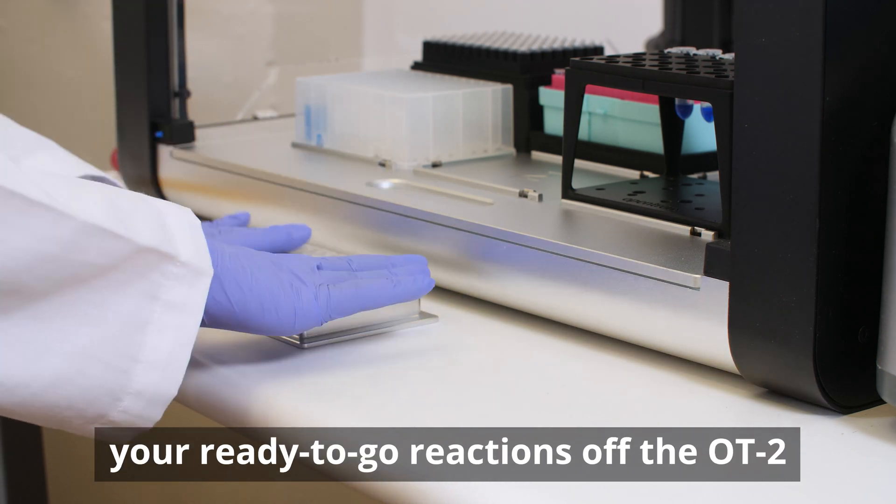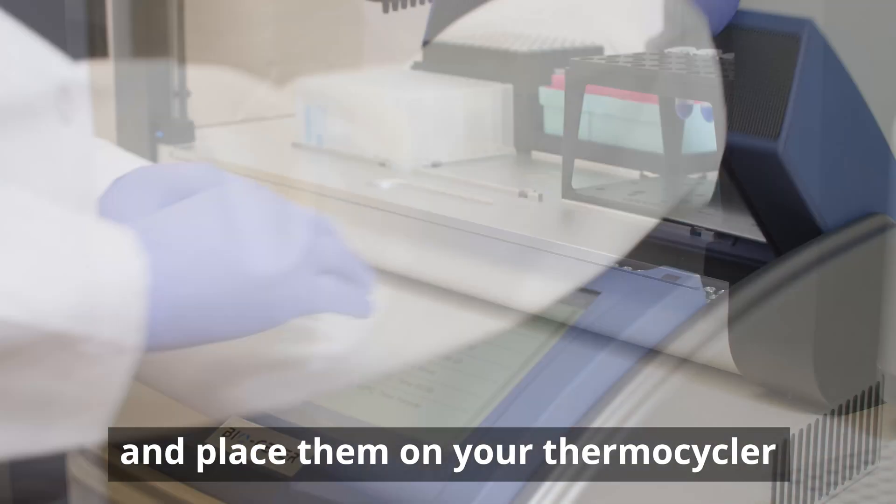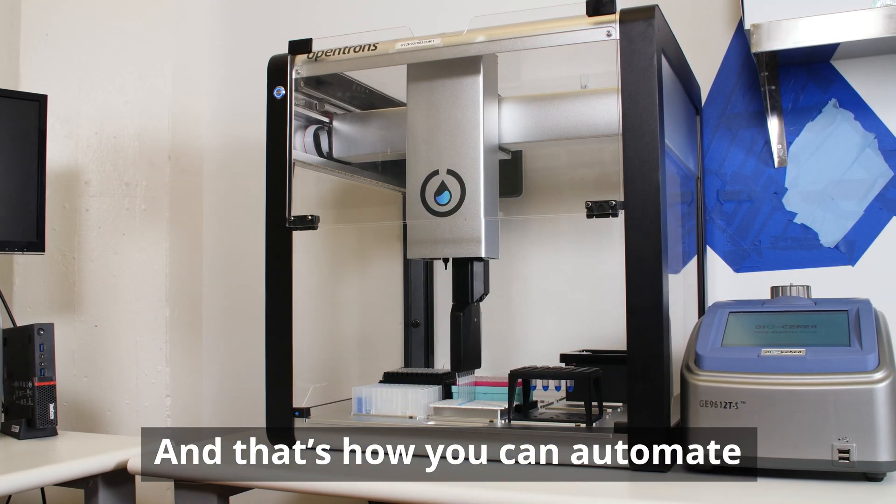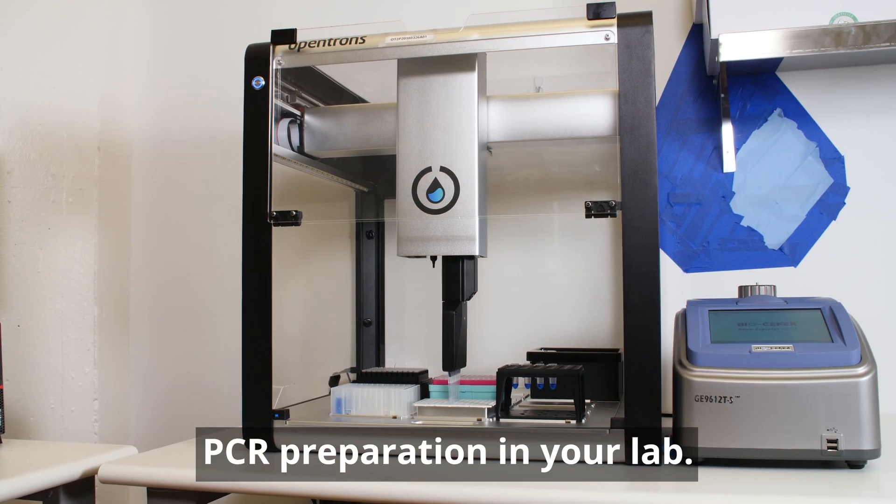When the robot is done, just take your ready-to-go reactions off the OT2 and place them on your thermocycler or qPCR machine to run. And that's how you can automate PCR preparation in your lab.